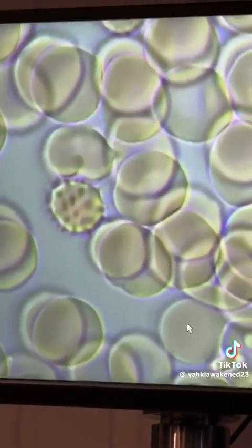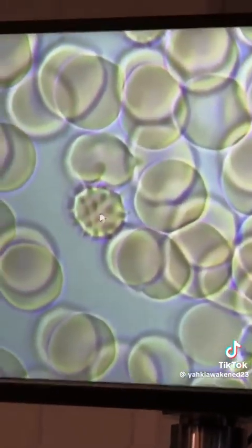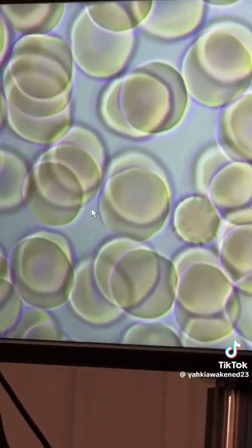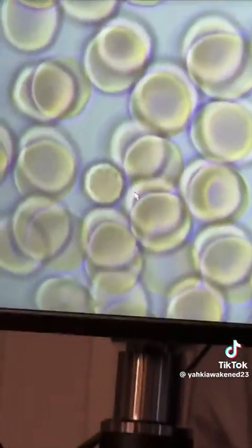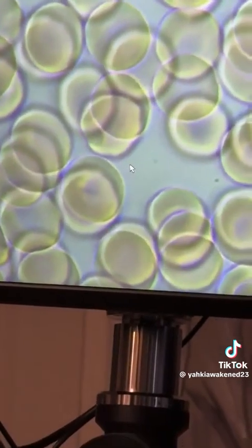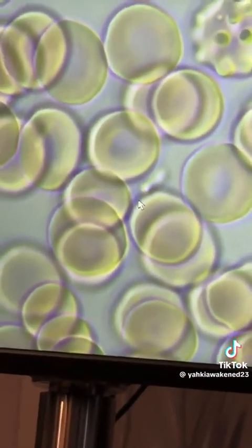I'm viewing this in bright field. Here go another echinocyte right here. And then what you will call all of this is erythrocyte aggregation, because you really don't have that much flow inside the bloodstream. But what I'm looking for is the lymphatic system. As you can see, we can see another big old parasite. Look how big this parasite is, y'all. This is a rod form parasite.